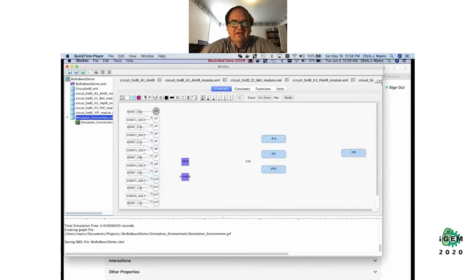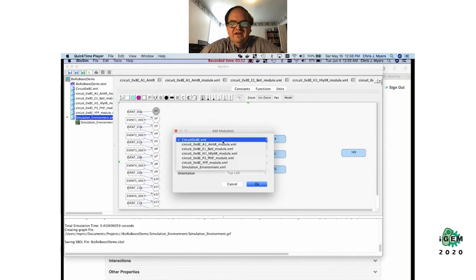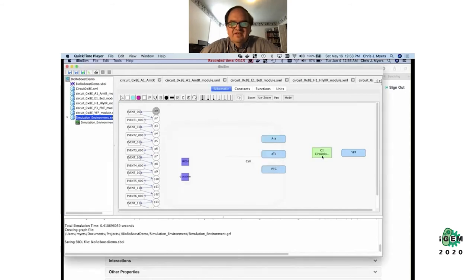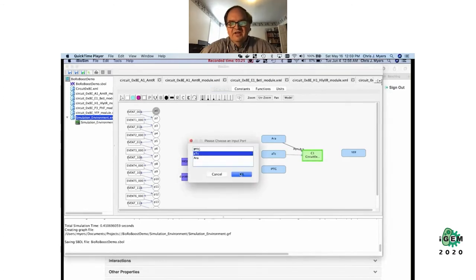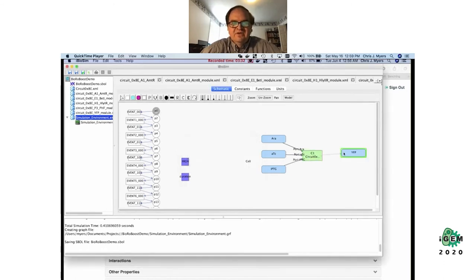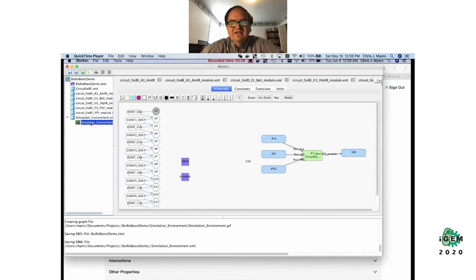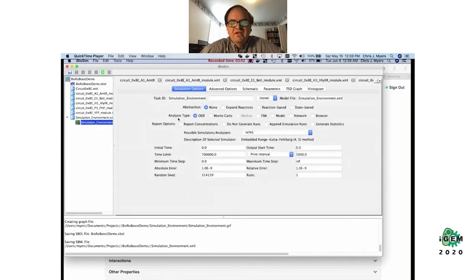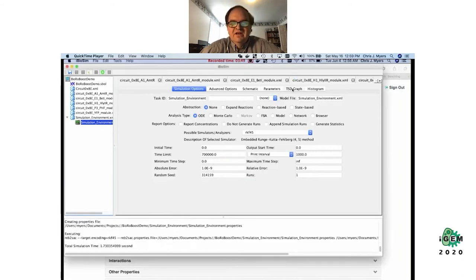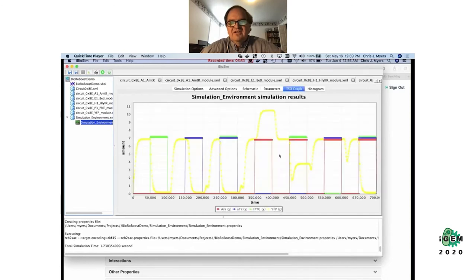I'm going to do a simulation of that model by adding the circuit into a simulation environment. This is pretending like you're in the lab and applying different small molecules and looking at what the circuit is doing by visualizing its response in the form of yellow fluorescent protein (YFP). I'm connecting this to the YFP output and this input stepper on the left will change each of the various input combinations and step through all the different small molecules you can apply to the circuit.